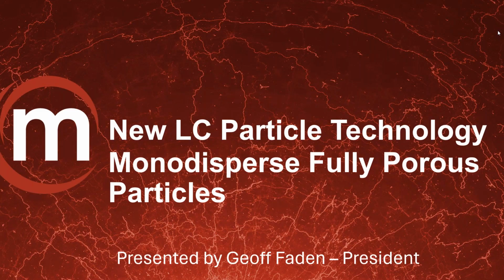Today, we will be discussing UHPLC and HPLC columns that are packed with monodisperse, fully porous particles, the advantage of this new particle technology, and how to leverage the increased efficiency to improve the resolution of your complex separations.